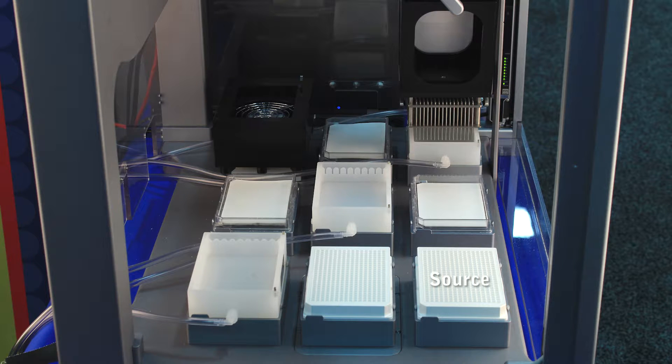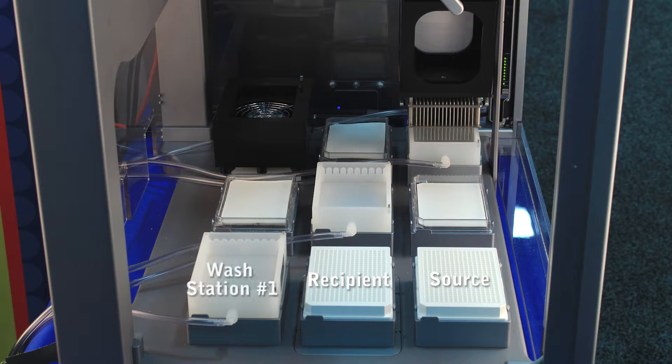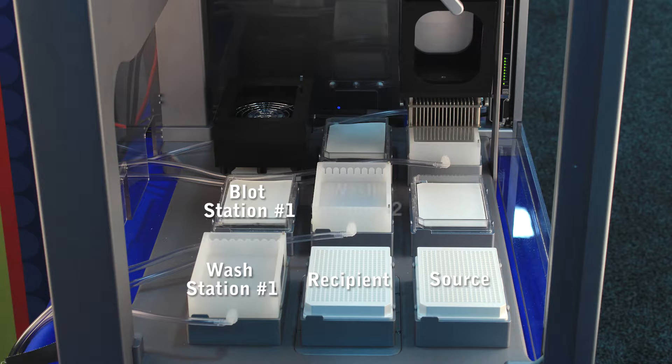The source plate is where the transfer cycle starts. Moving to the recipient or daughter plate, wash station number one consists of either 10% bleach or DMSO, then a blotting station, then wash station number two filled with distilled water.